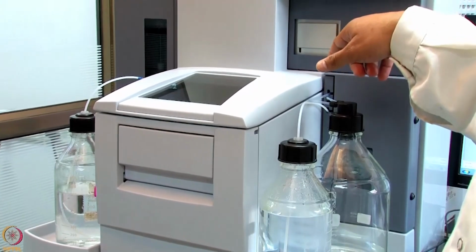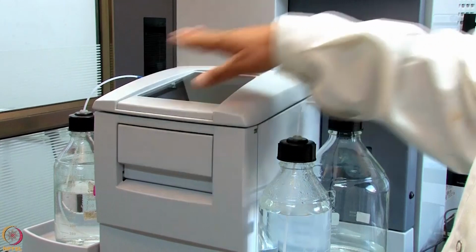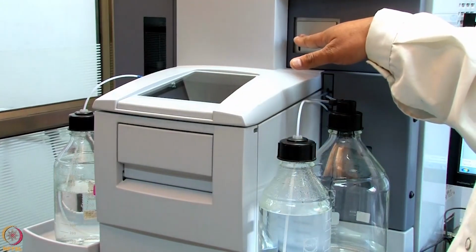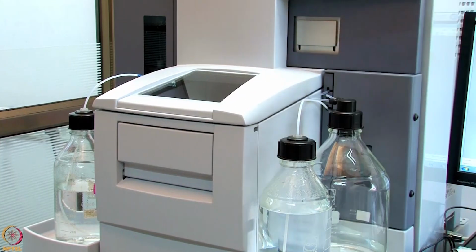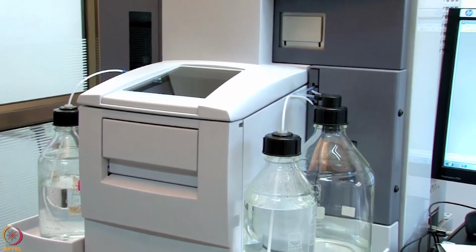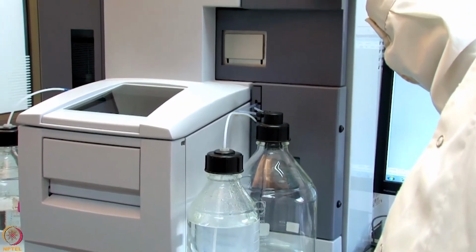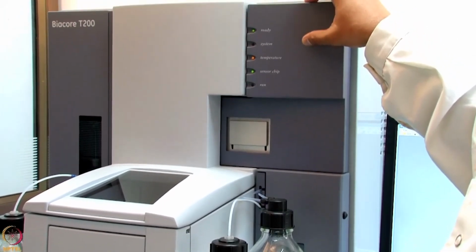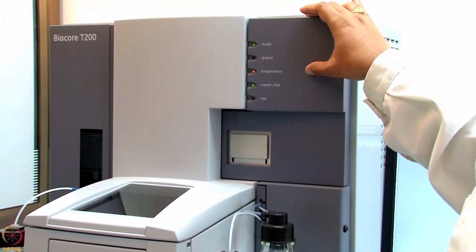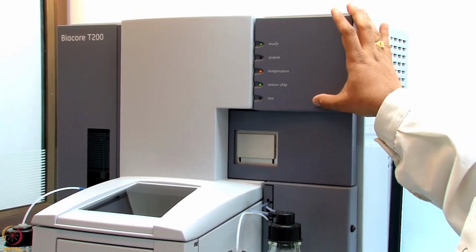So the experiment starts by picking up samples from this compartment and transferring them here at the interaction site, and then the experiment is recorded on the screen. Here are some kind of indications are provided when the machine is ready or the system is calibrating the temperature, when the new chip is docked and the run is actually happening.